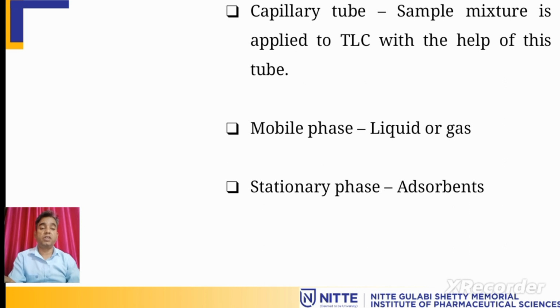So all this is involved when you do a separation of a compound using adsorption-based chromatography. And then again, the mobile phase you choose here is a liquid or a gas, and the stationary phase you choose depends upon what type of compound you are going to study.